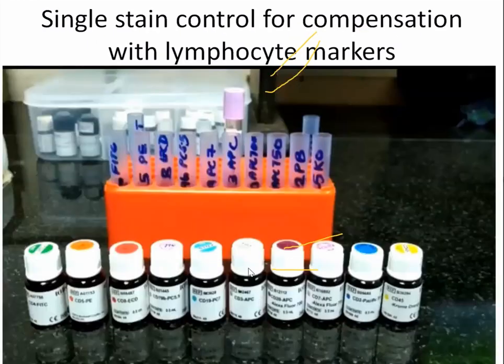Okay. So this is how we do compensation. This is normally done by the application specialist. He comes and does the job for you. But you should know what is happening, and if there is a need, you can also do it. Now, I'm not using beads here. Beads are available, and they are very simple. You get compensation beads, you drop any antibody, and it will bind. All you need is an antibody of that particular fluorochrome which is there in your panel or experiment.